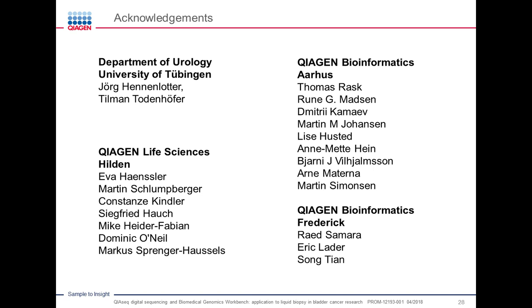However, if you want to design more complex filtering, you can click on the link that you receive in the Workbench and access the web interface of IVA, and then add, remove, modify some of the filters in the filtering cascade, like in the boxes that I showed in my presentation.